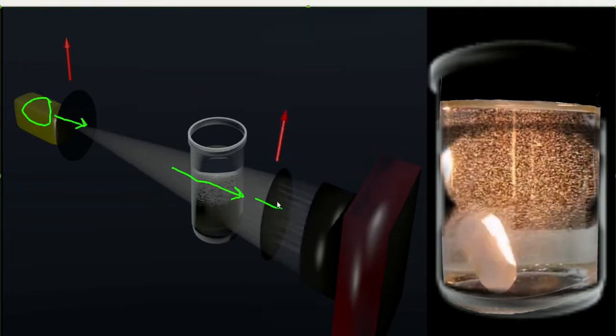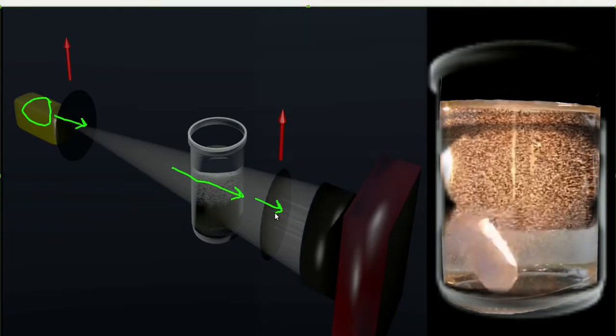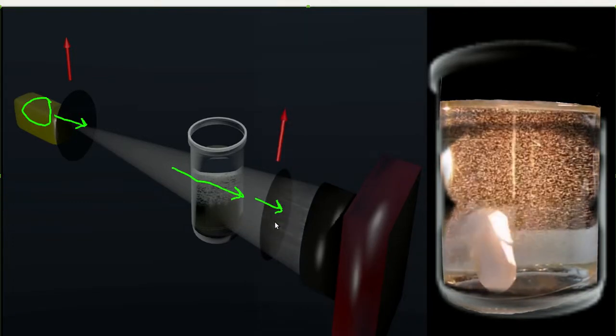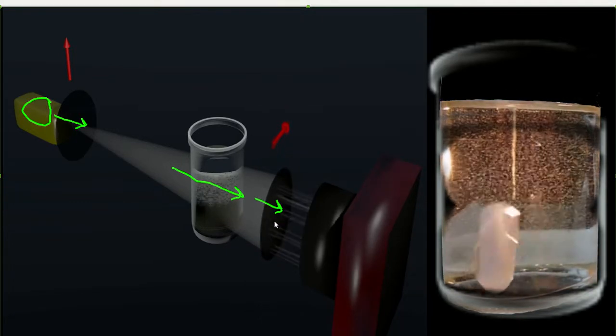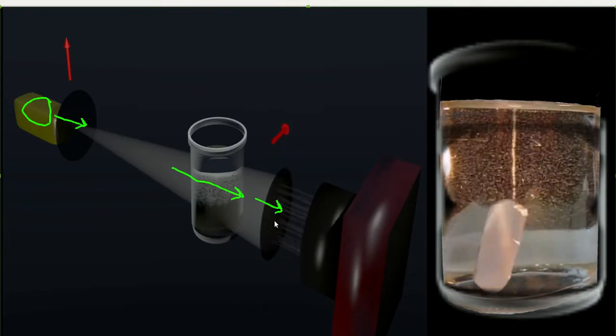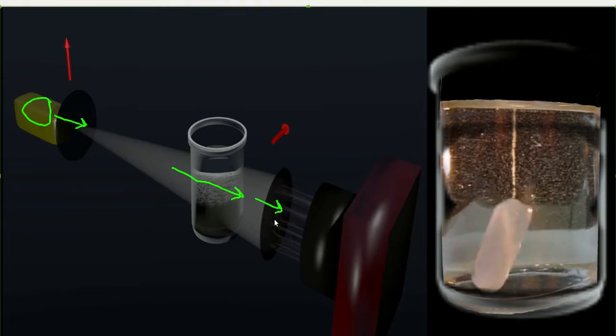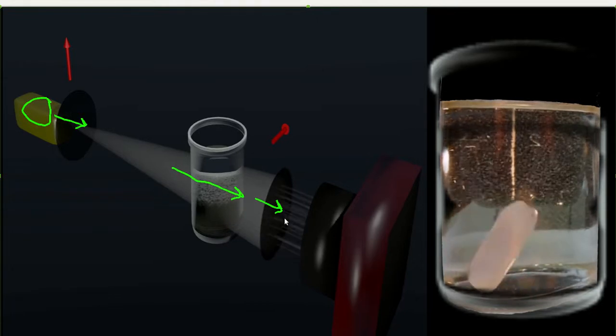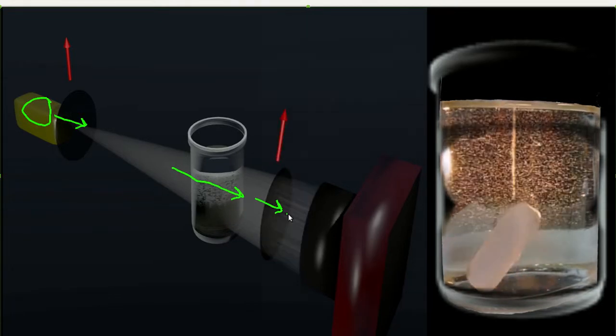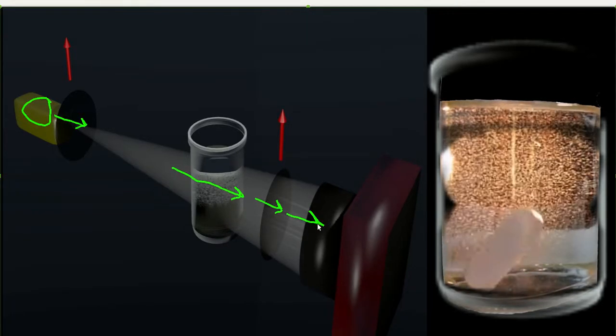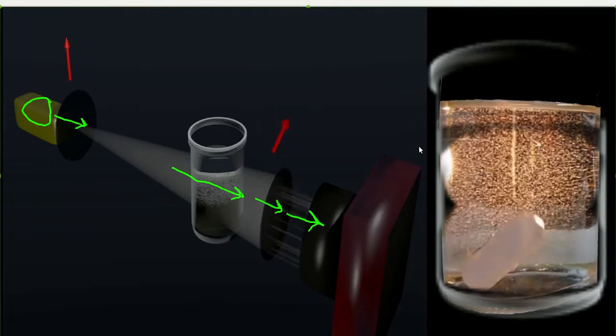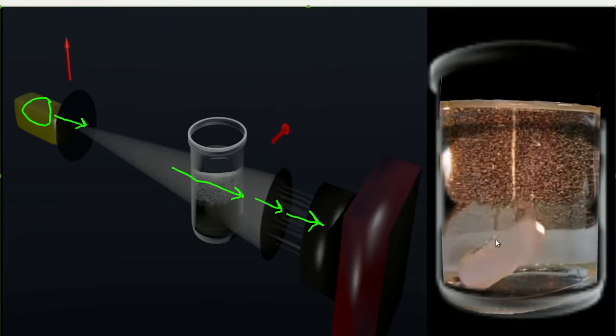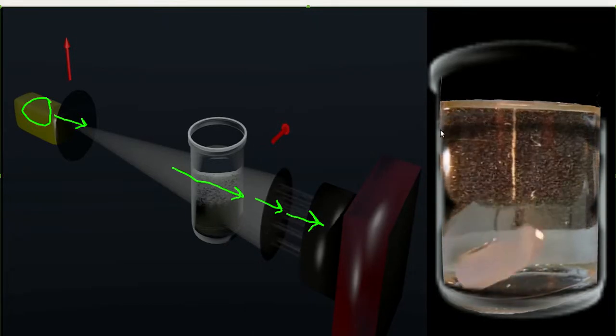The light then goes through a secondary polarizer referred to as the analyzer which can be oriented either parallel or perpendicular to the first polarizer. Finally, the light is detected by our camera and the image is shown on the right hand side.